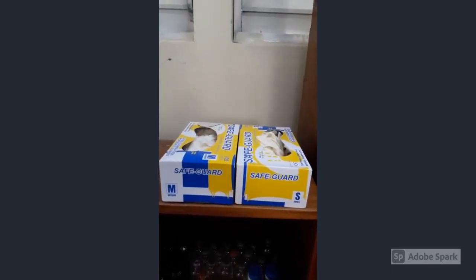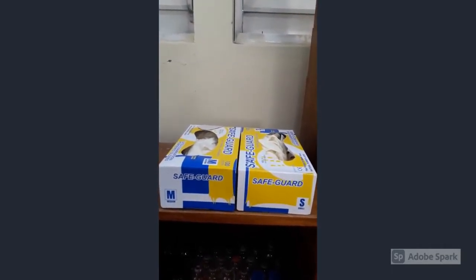We also have your gloves, and there will be different sizes provided for you: large, medium, small. And we also have the pill jars that are normally kept to the side of this lab.